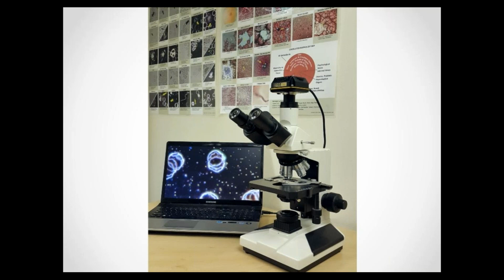So we have another question. How long can you expect the bulbs to last? Would that be in the halogen? Yeah, that would mostly relate to the halogen. The halogen bulbs do tend to go. You could expect to replace at least one bulb a year. It might be more often depending on how regularly the microscope is used and how long the light is left on. The process to change the bulbs is not really that difficult.